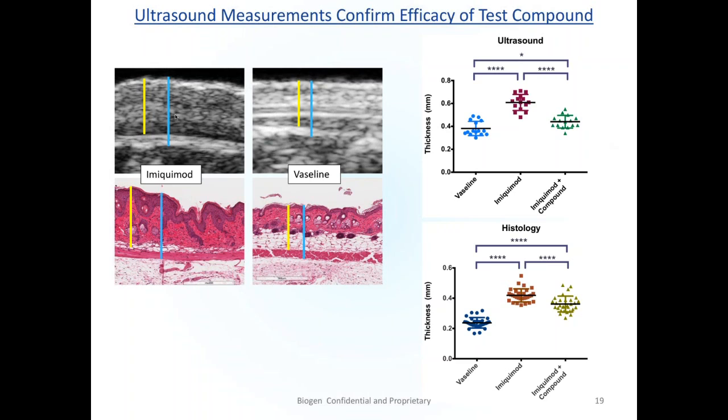Exactly. And we had a lot of conversations about that as well, because the histology is a bit of a translated interpretation of what the live tissue looked like. I forget what the percentage value is, but it's established. The pathologists know what percentage of shrinkage you might have. But you've also got to do some cutting to remove this tissue, and then there are all the treatments and chemicals that go into preparing this tissue before it gets on the slide.